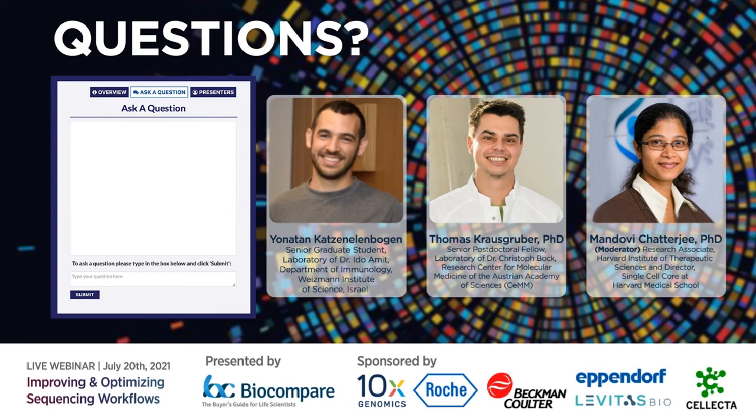Depending on the particular experiment, we suggest what platform would be best, how many samples would be necessary to sequence. And given that single cell experiments are very expensive, often the decisions are guided by the funding situation of the lab as well, and we consider those too. I see. No, that's useful to know.